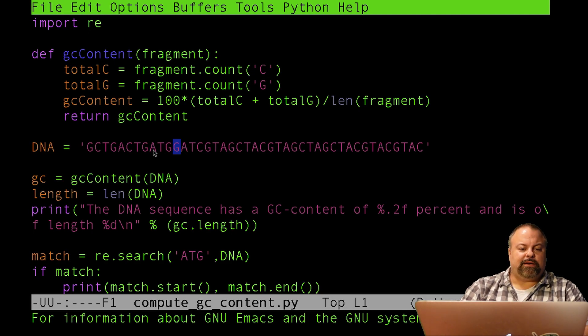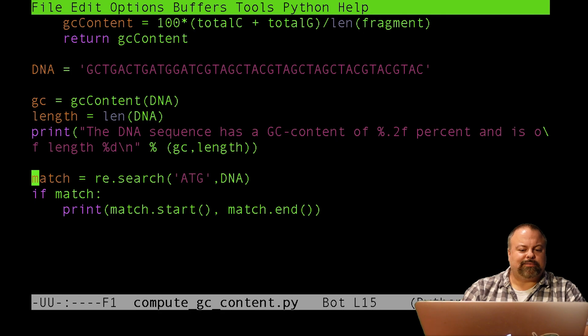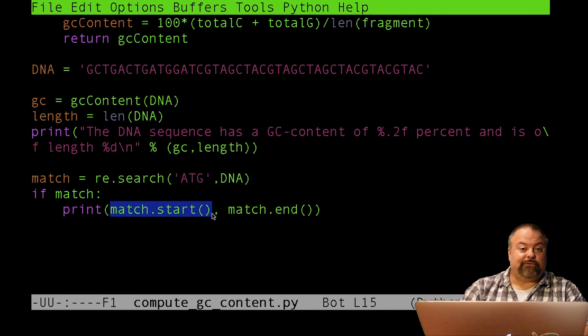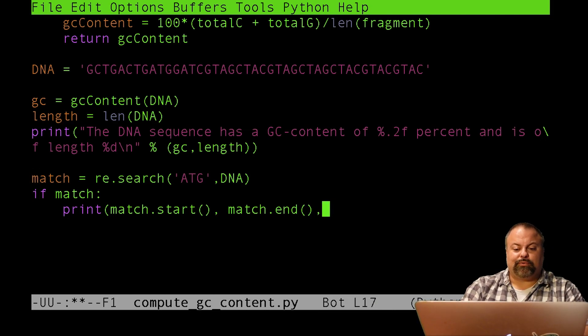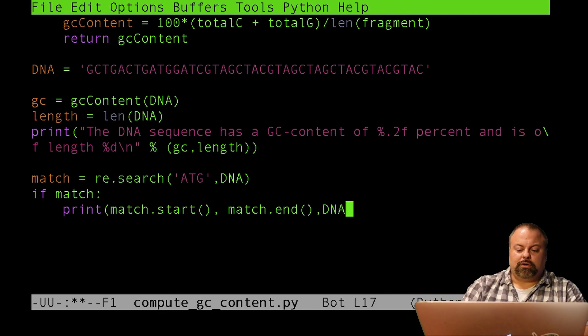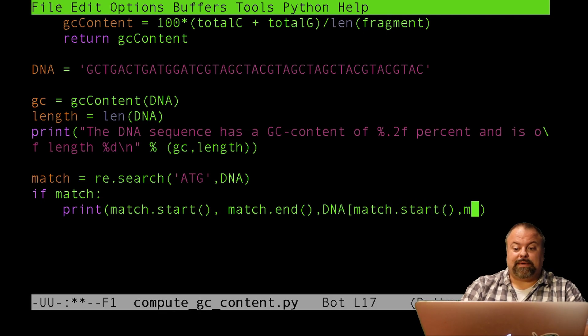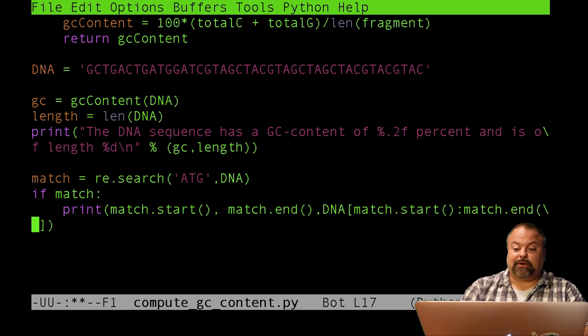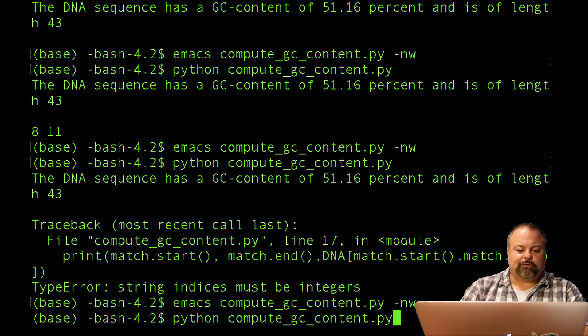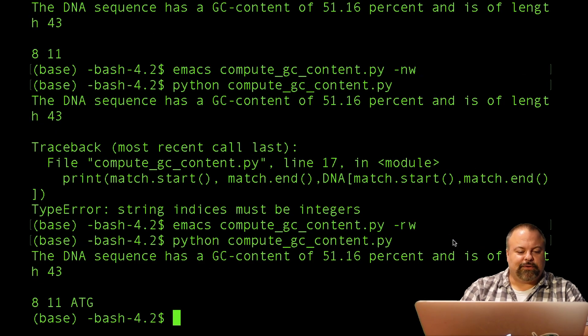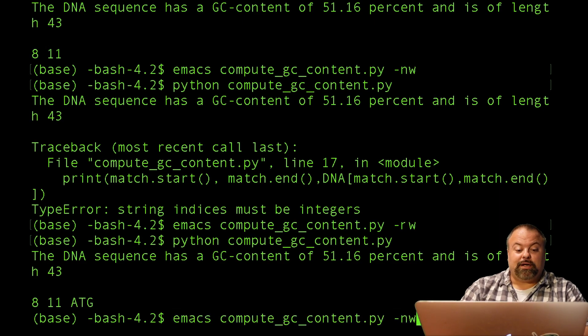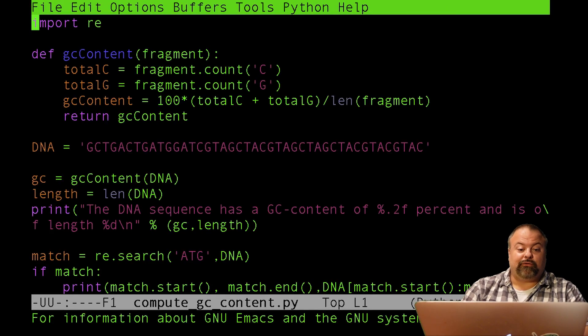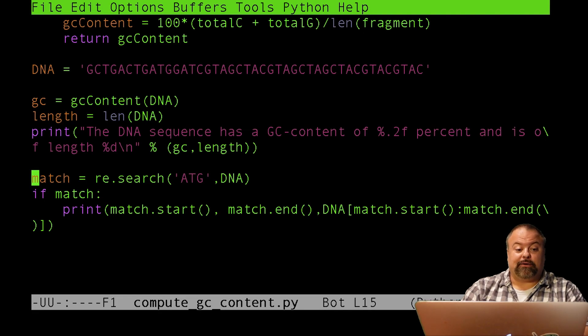So you notice that 11 is actually 8 plus 3. It's actually one more. It's this G right here. So in other words, 8, 9, 10, 11. So the start and end defined by this match object, therefore, are done in such a way that it's consistent with Python substrings. Indeed, we can validate that by typing out a third print statement and say DNA of and define that substring, which is going to be match.start and match.end. And there's our ATG. So I was able to find it.